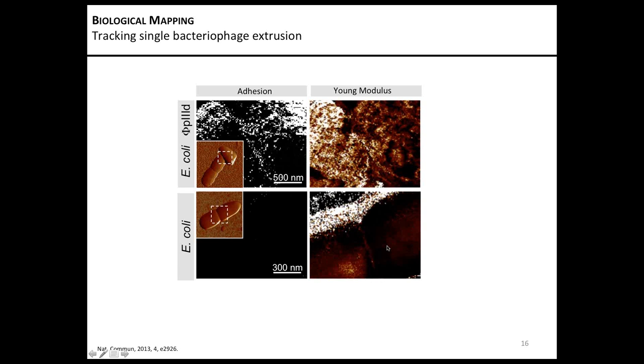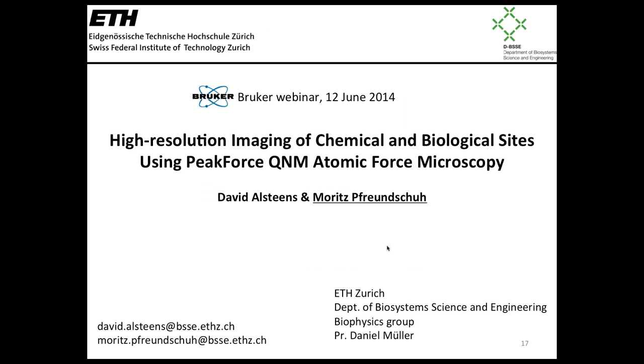Which means that using this kind of PeakForce technology, we are able to solve a much more complex biological question, and this is very helpful to understand several processes. So now I will give the talk to Moritz.